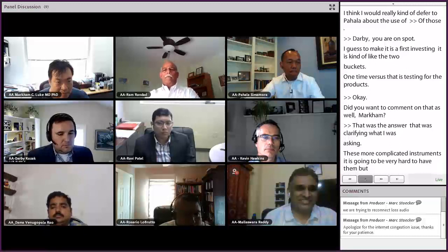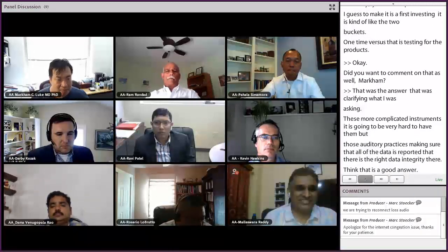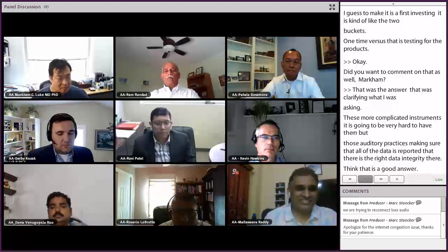And then the more routine ones, obviously like SEC or SEC-MALS or SEC-UV-MALS, those could potentially be routine, right? So maybe the SEC-UV, in that case, my understanding is it would need to be validated and under GMP. Correct, Ram?